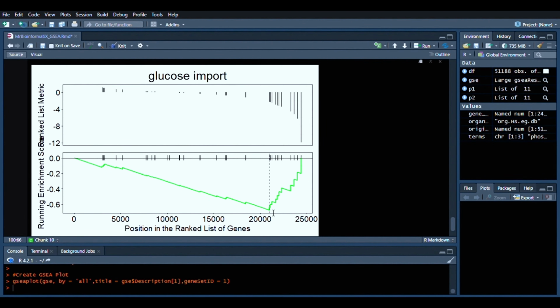To do this, GSEA creates a version of the dataset with phenotype labels randomly scrambled, produces the corresponding ranked list, and recomputes the enrichment score of the gene set for this permutated dataset. GSEA repeats this many times. The default is 1000, and it produces an empirical null distribution of enrichment scores.